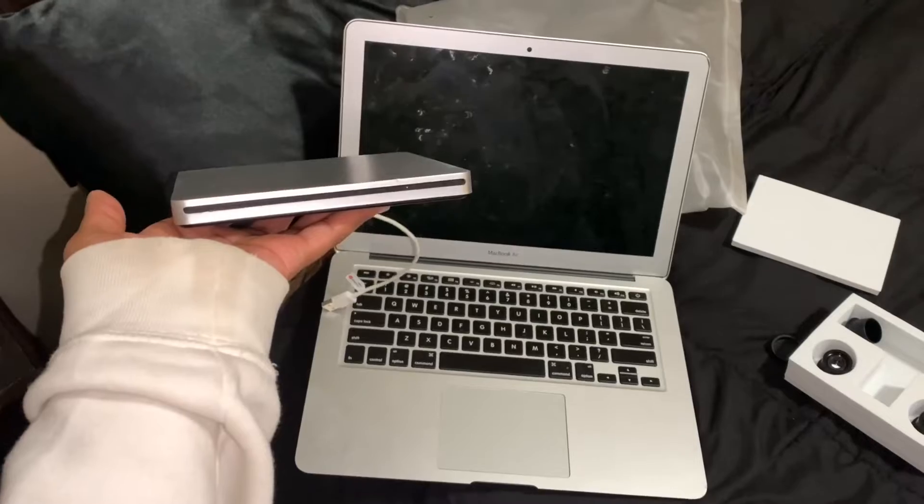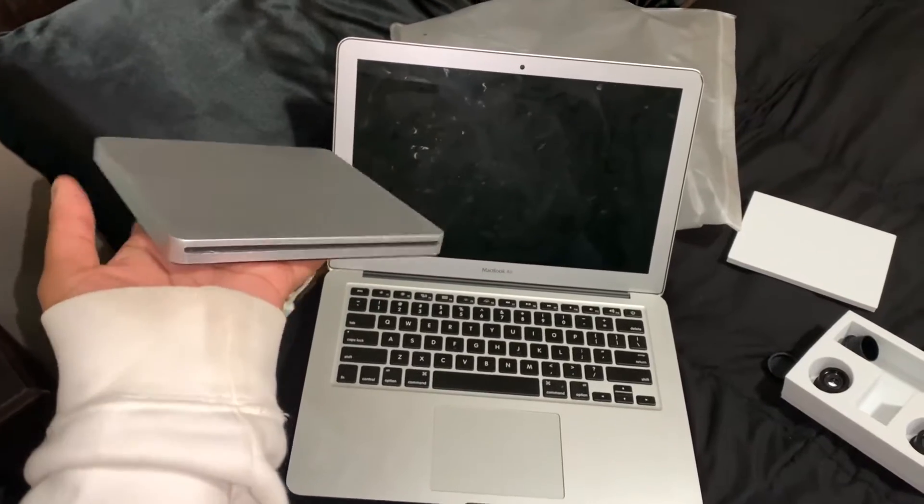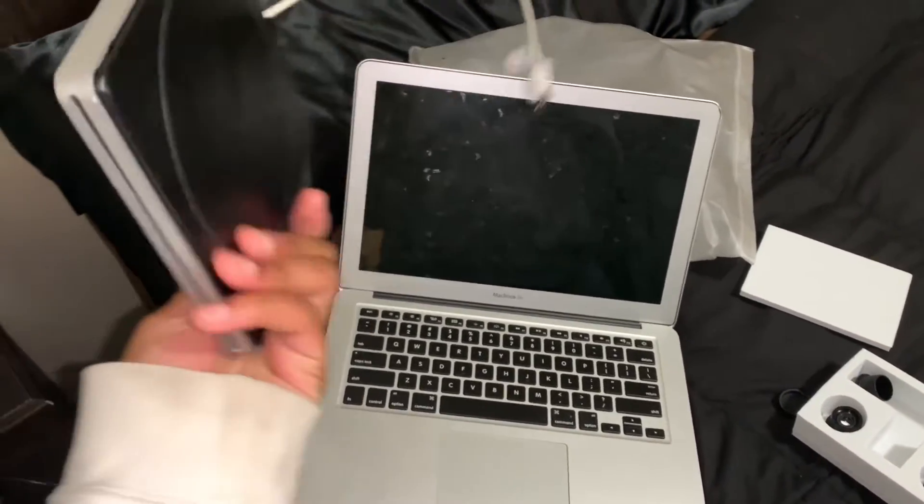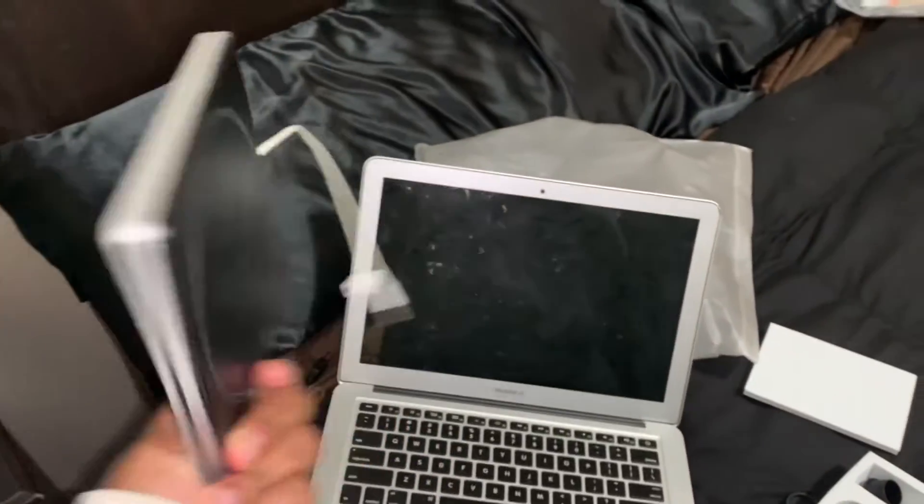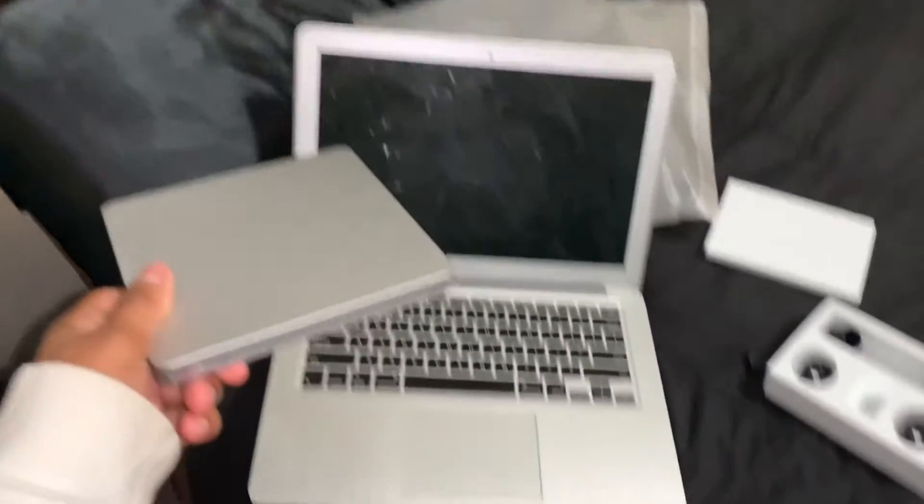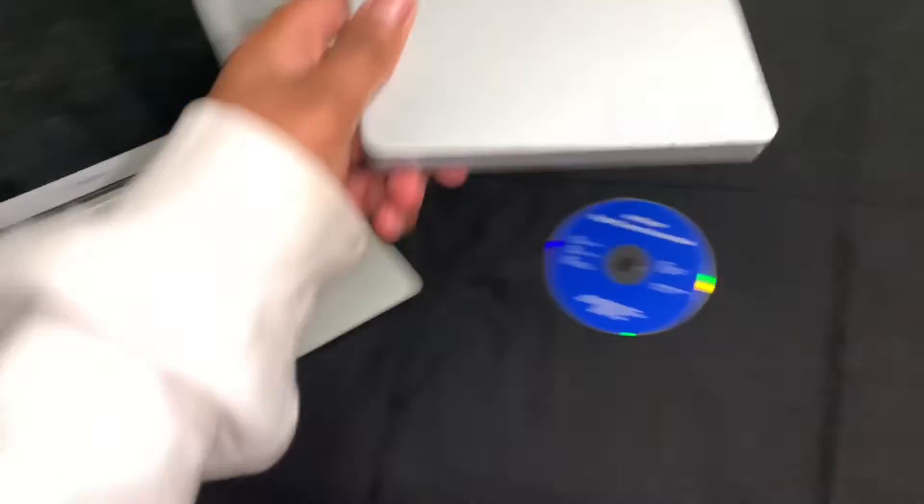So you're also going to need a DVD player that is compatible with your MacBook. I ordered mine from Amazon.